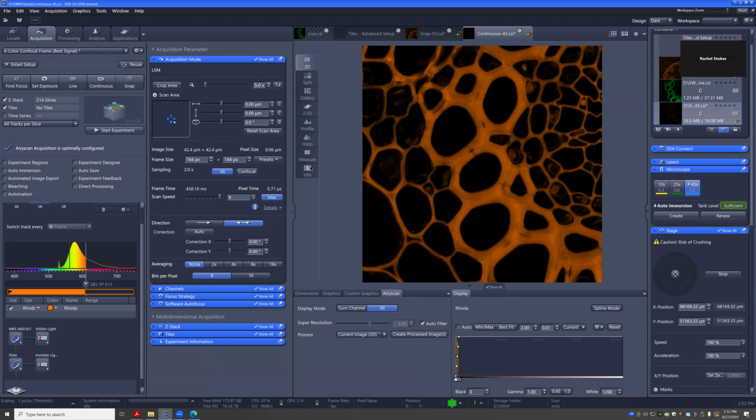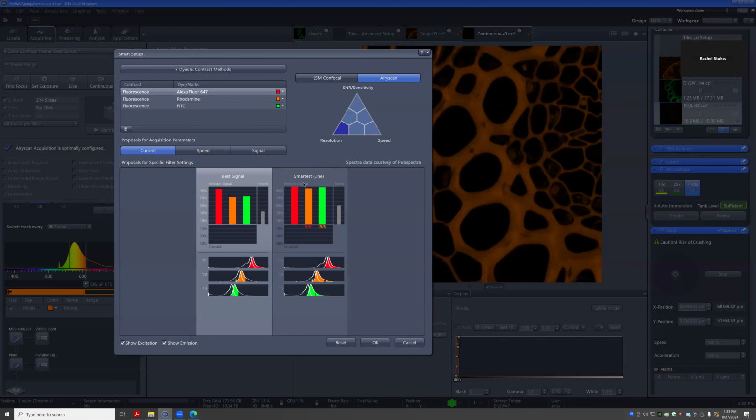Basically, you zoom, say like a 5x. Now, that same frame in continuous will take less than a second, right? Like half a second. So that refresh rate is a lot quicker. So that's one trick to really do the alignment quick and continuous. And I'll show you the situation where you would need that.